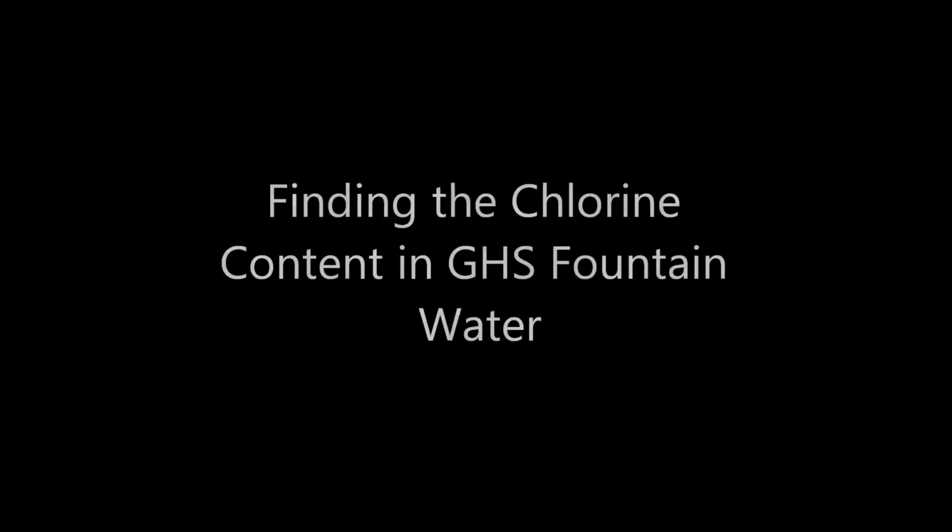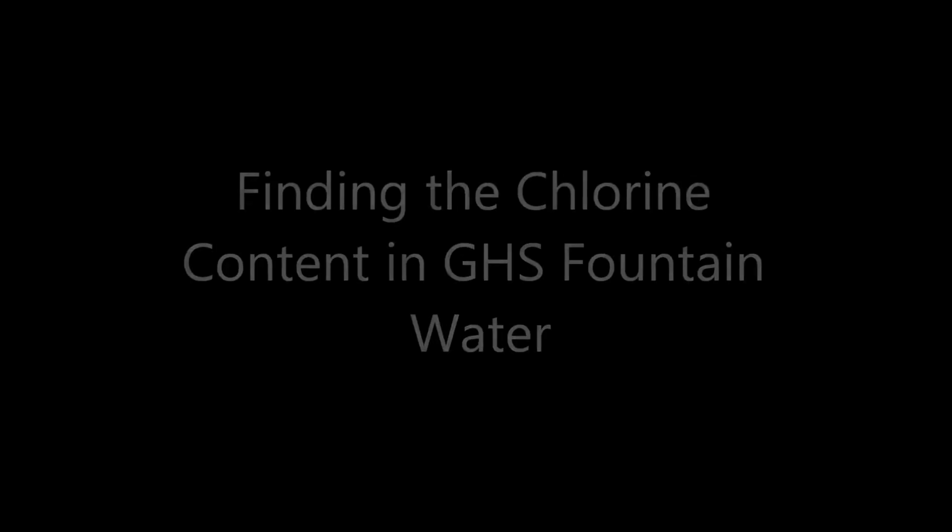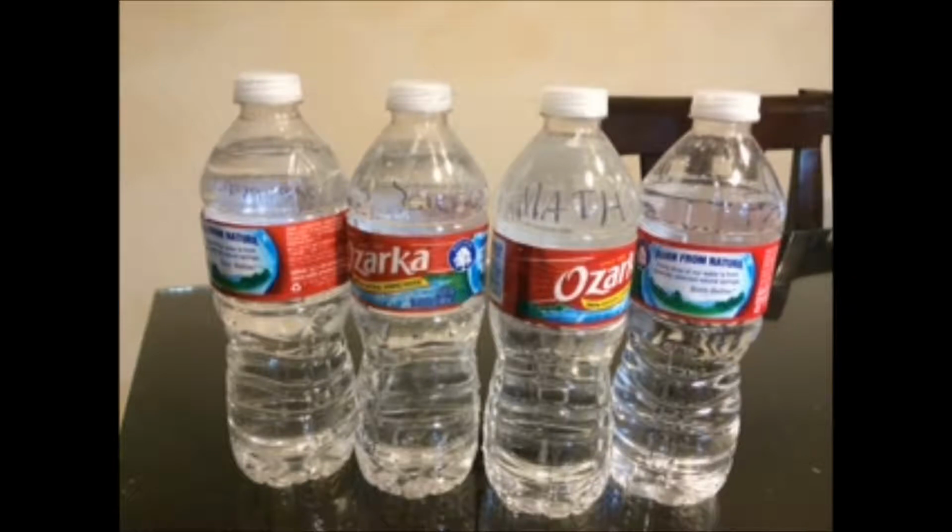The purpose of this experiment was to calculate the concentration in parts per million of chlorine that is present in the fountain water at GHS. We collected samples from the Science Building, the Math Hall, the Fine Arts Building, and the Language Hall. We made sure that the water bottles we collected the water in had been washed and dried the night before so contamination could be minimized and controlled.